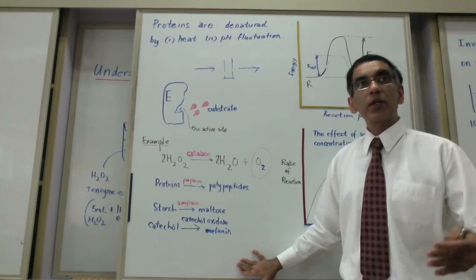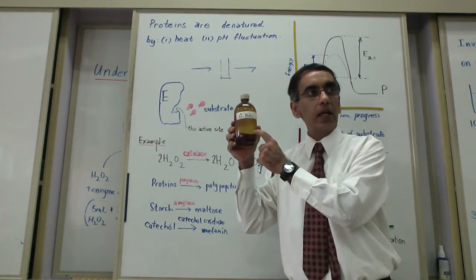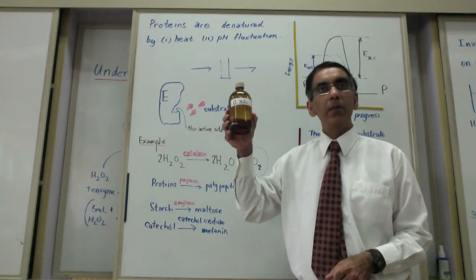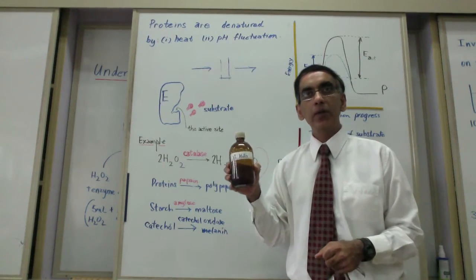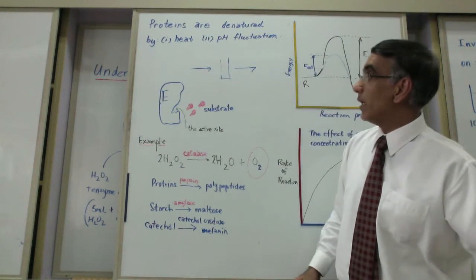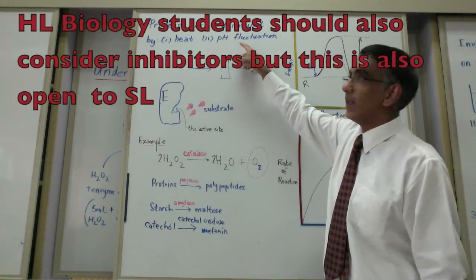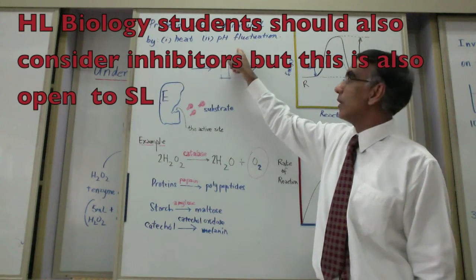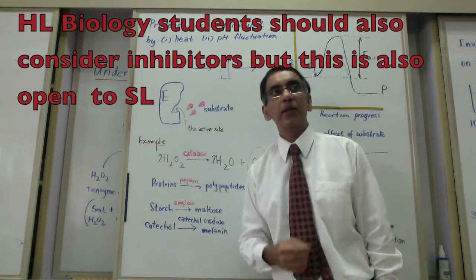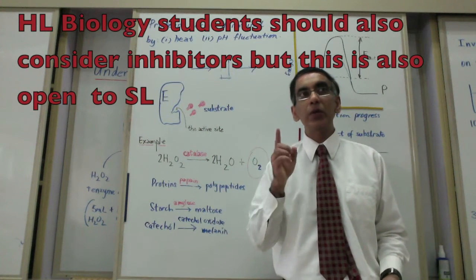You can think about changing the substrate concentration, which is the peroxide, which we're keeping constant today. But you can change it from 3% to 1% to 5%, whatever. It's been made and set at 3% today for you, but you can manipulate this variable if you choose to. Then you can manipulate temperature, because enzymes are protein. And they are affected also by pH. So we can change pH with buffer tablets, and we can change temperature, and that could be another factor that we can change.